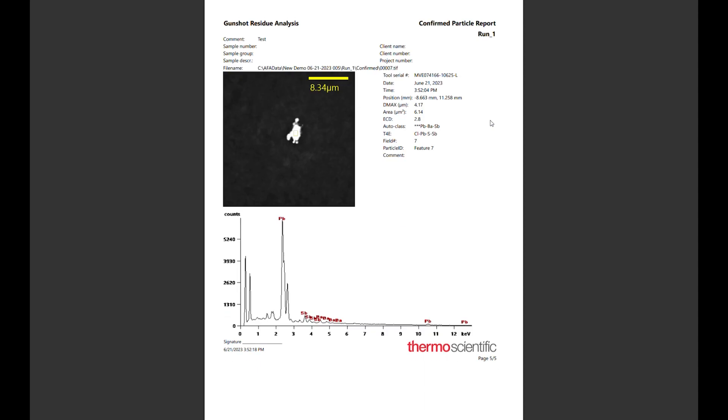The final section is the confirmed particle report, which shows the manually updated image and spectra. This generated report follows the ASTM standard 1588 specification and is ready to go the moment it is saved. Now we can exchange our samples and begin another run.